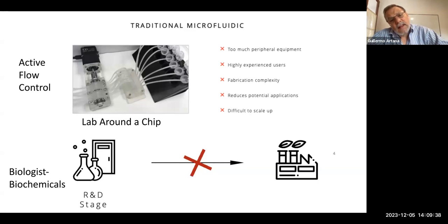In my opinion, microfluidics enabled a lot of research for biologists and biochemists, but there was a little bit of difficulty to scale up and pass to a large aspect of industry. As we are engineers, we are interested in this kind of transfer to the industry. So one of the reasons, though we did not abandon the other aspect, why we were interested in capillary microfluidics was this.